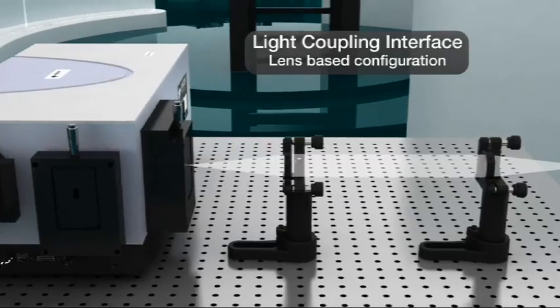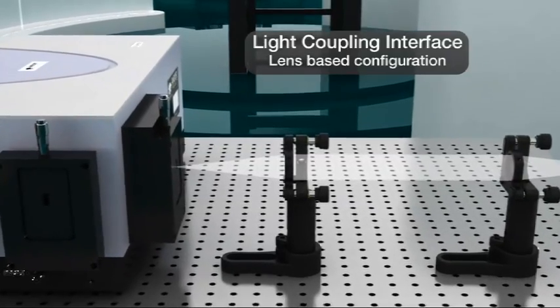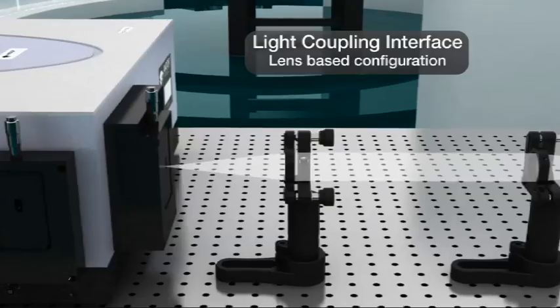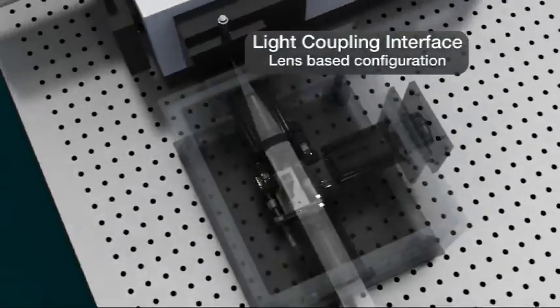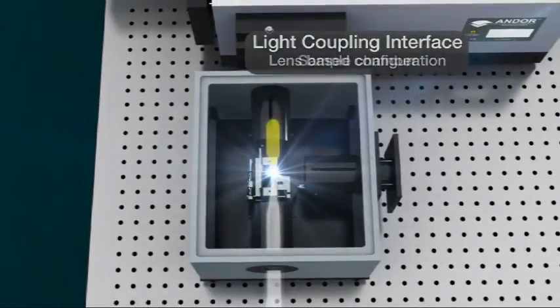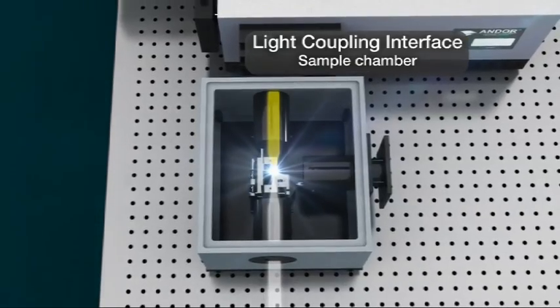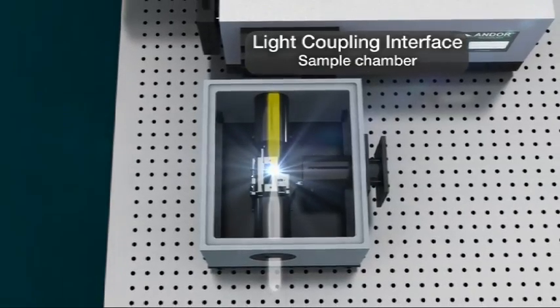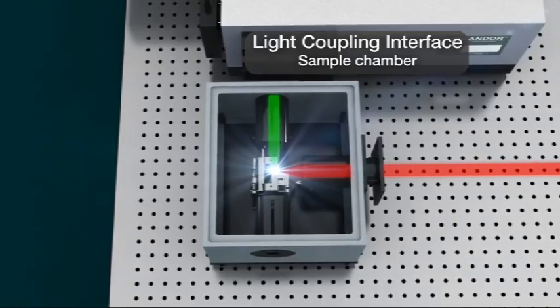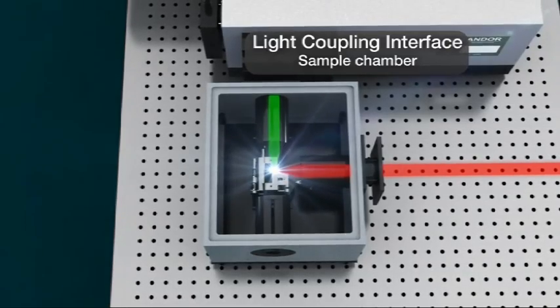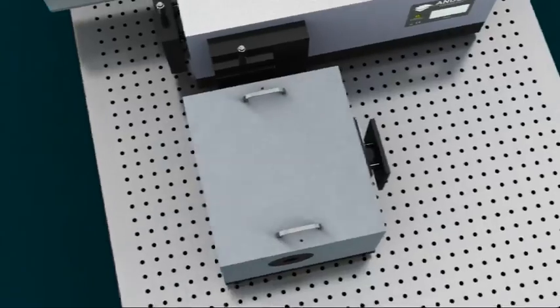This includes simple lens-based configurations or more complex setups based around a sample chamber for absorption and transmission experiments or reflection and fluorescence experiments.